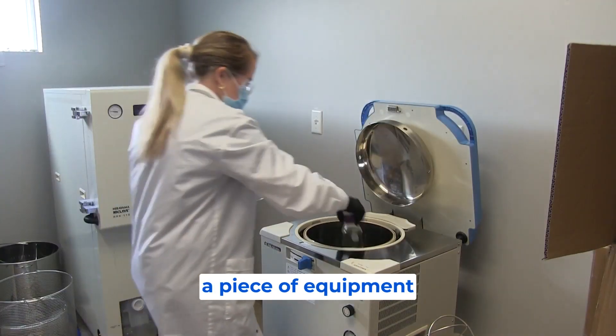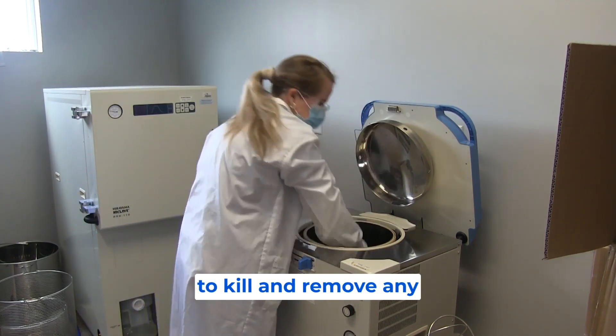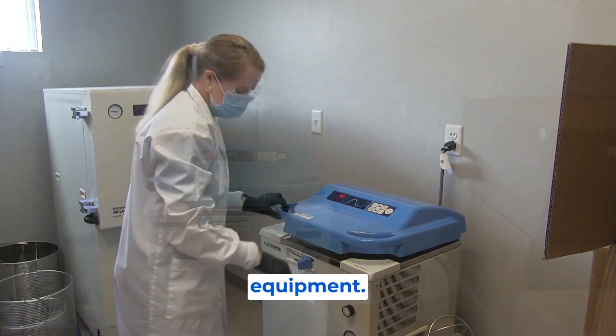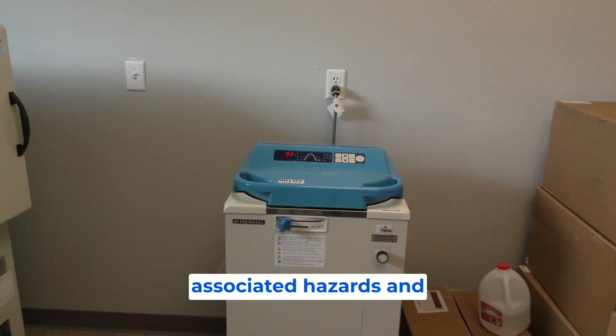This is achieved through a piece of equipment called an autoclave. It combines pressure and steam to reach the temperatures necessary to kill and remove any biological agents that may still be on the equipment. Autoclaves are a common site in most laboratories, but they still have associated hazards and warnings.